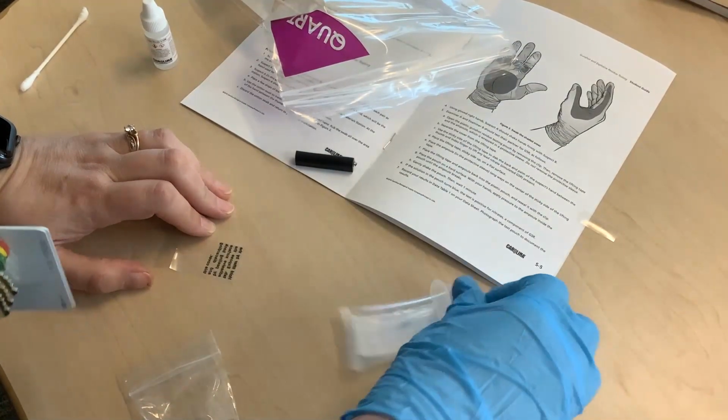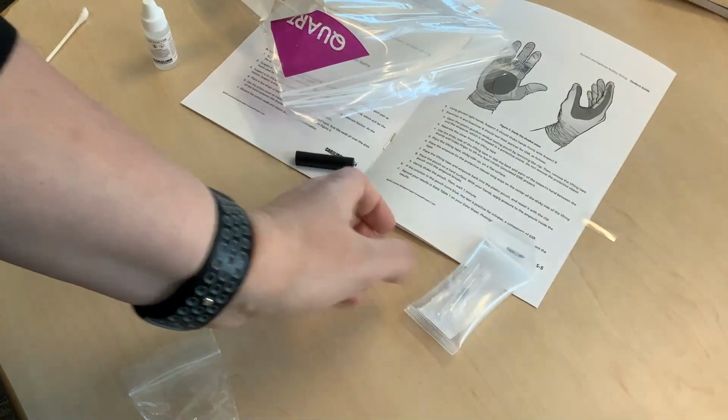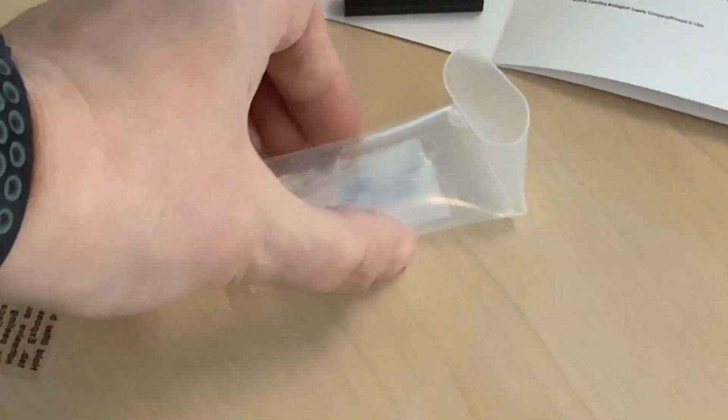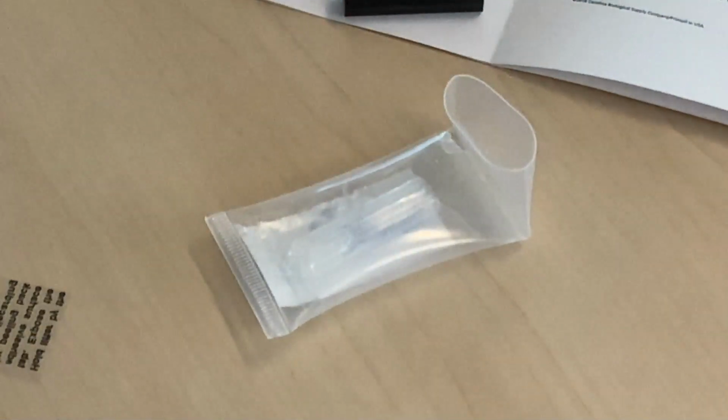If the solution in the pouch turns blue, which you can tell it's already starting to turn a little bit blue here, zoom in, you can see it's starting to turn a little bit blue underneath there, then that means that there were nitrates there, and so it is positive for gunshot residue. That's how you do the lab.